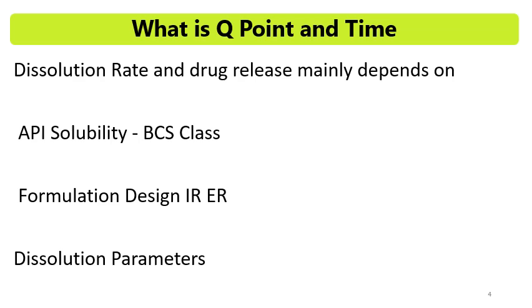If you set the dissolution parameter like 75 RPM for paddle, and at another time you set the parameter for paddle apparatus as 50 RPM, dissolution will vary with the speed or RPM of the paddle. That means the Q point will also vary, or the release will also vary, with the dissolution conditions and parameters. So always the dissolution parameters or conditions are selected as standard.